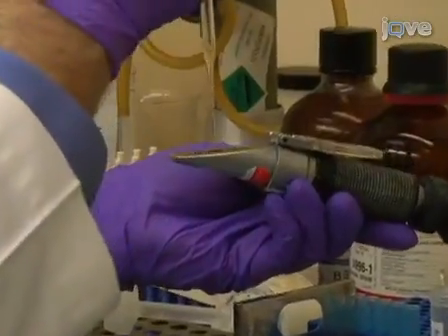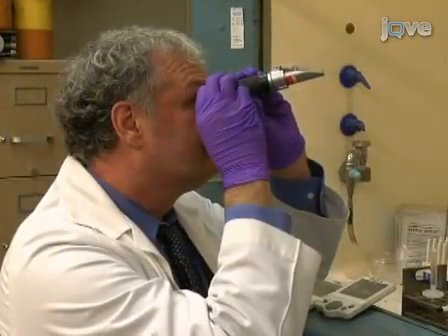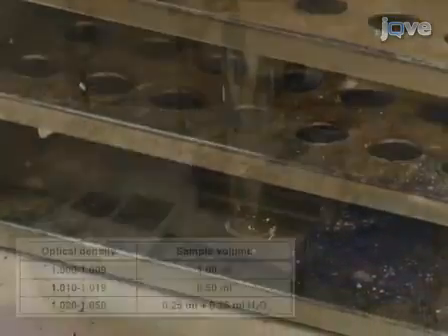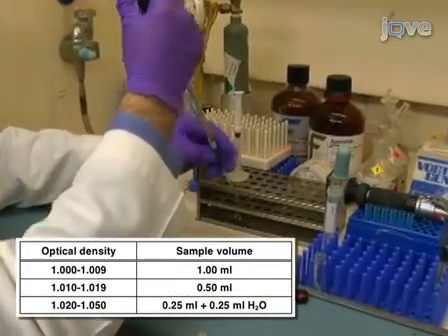Next, measure and record the optical density of the sample by placing a couple of drops of urine in the handheld refractometer. After measuring the optical density, filter the sample through a 0.2 micron filter. Measure out the volume of sample according to the optical density measured prior to filtration.